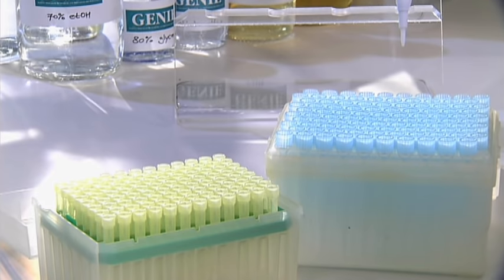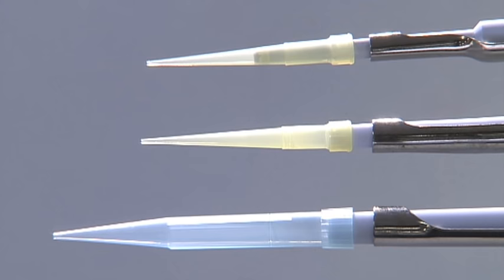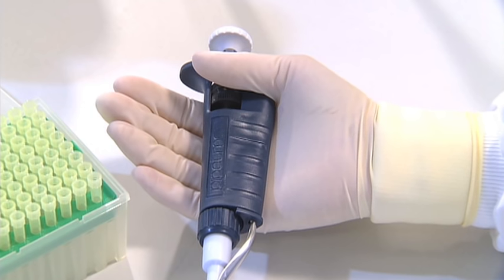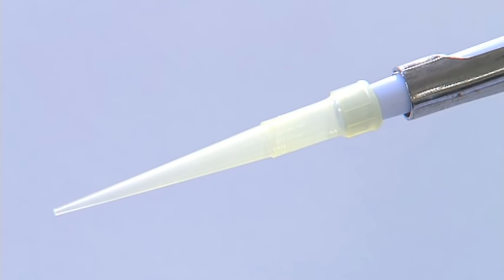Once you've set the volume you need, attach the appropriate pipette tip to the end of the pipette. P20 and P200 pipettes use the same yellow tips. P1000 pipettes use larger blue tips. A filter tip is often used in the laboratory — the sterile filter within each tip helps to prevent contamination. Hold the pipette with one hand with the narrow side resting in the palm. Add the tip by gently but firmly pushing the pipette into the tip held in a tip box. You may need a little practice to achieve a good airtight seal.